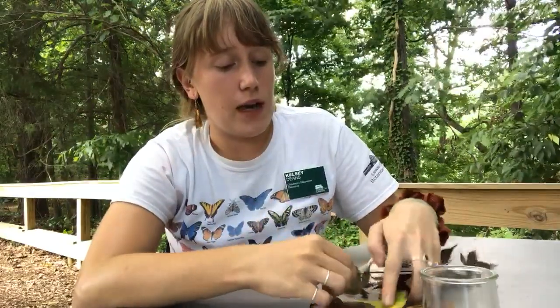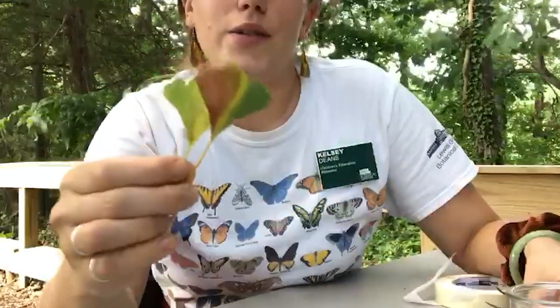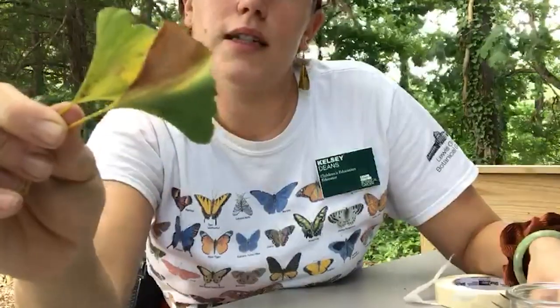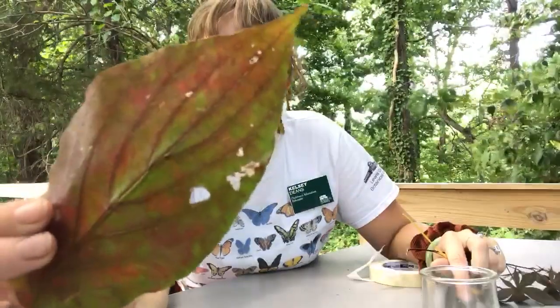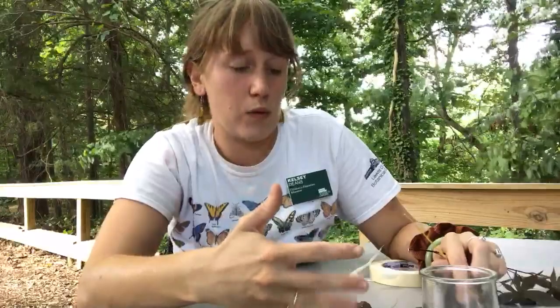For our chromatography, we're going to be comparing three different leaves. The first one is this nice pretty burgundy Japanese maple, and then I've got some yellow and green and brown ginkgo leaves, and then I have a bright red, yellow, and green dogwood leaf. What we'll do is separate those pigments and see which ones are in each leaf and talk a little bit about what they do.